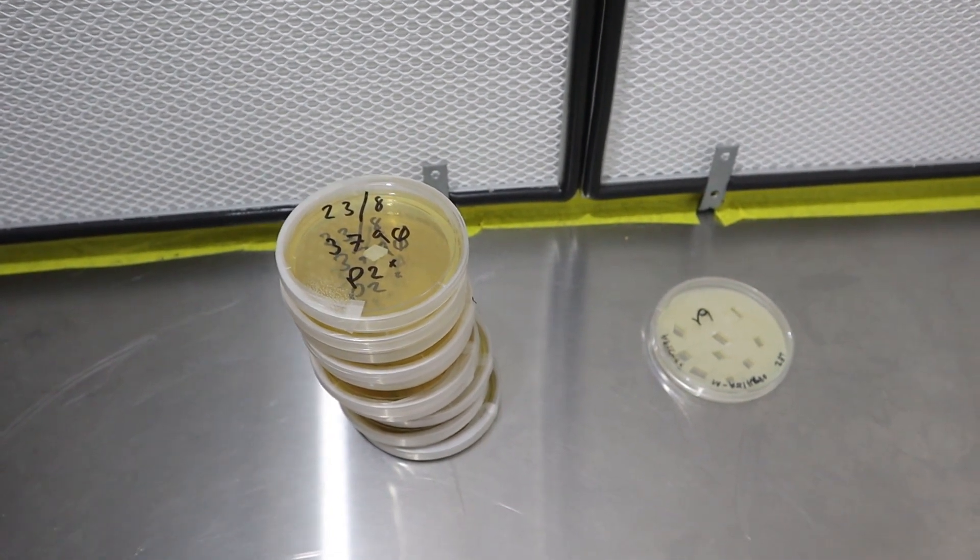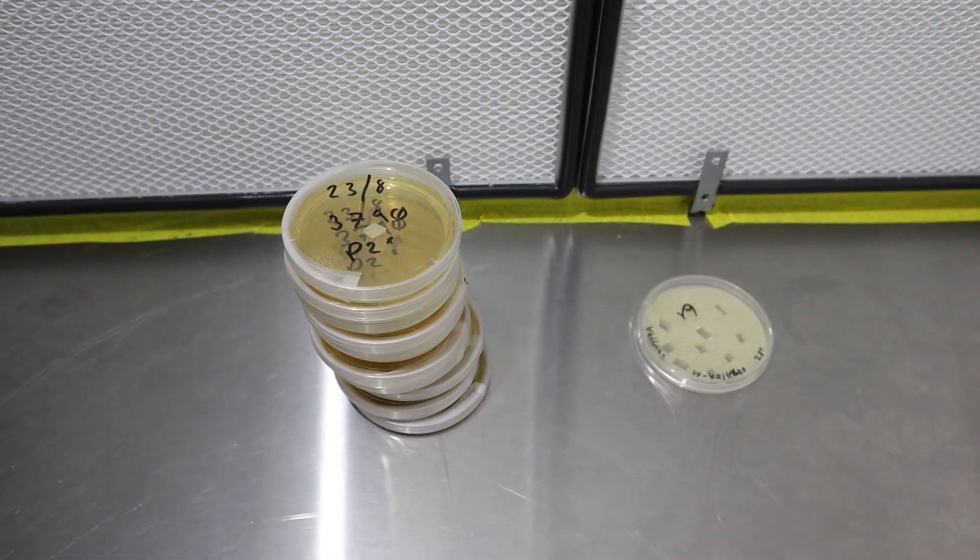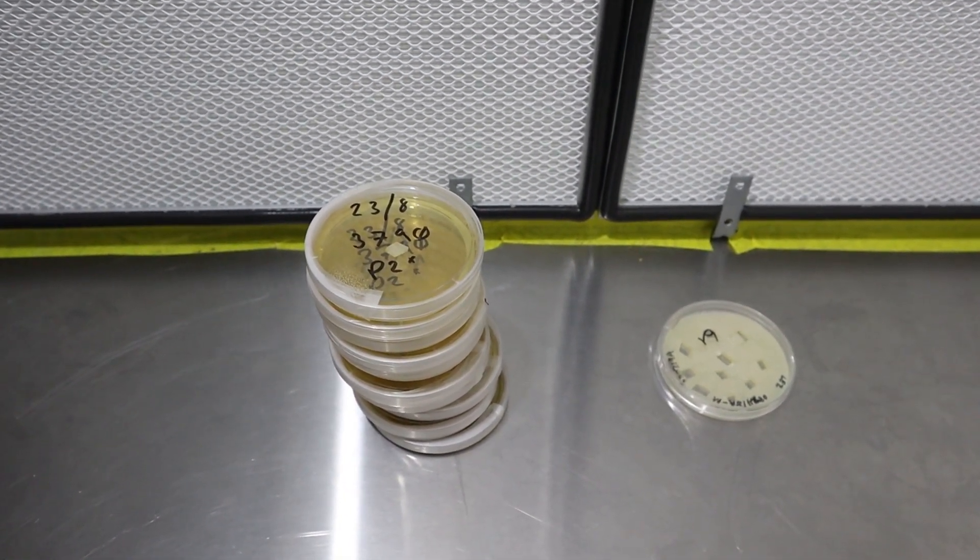So yeah, happy about that. We'll get them to my little incubation space for my plates and we'll incubate those for a few days and see how they grow out.